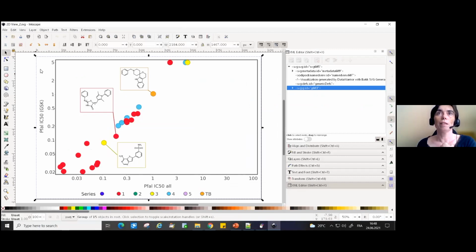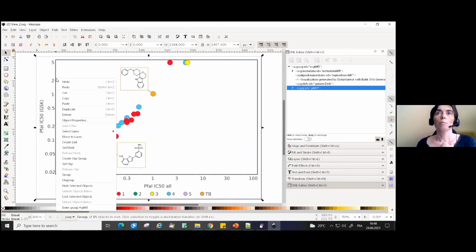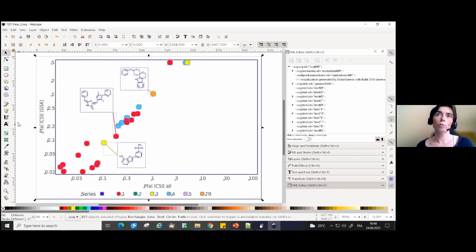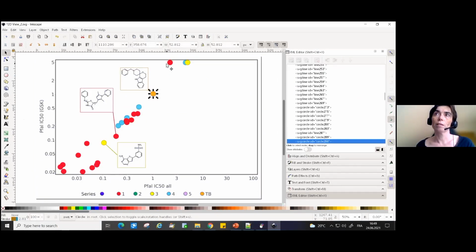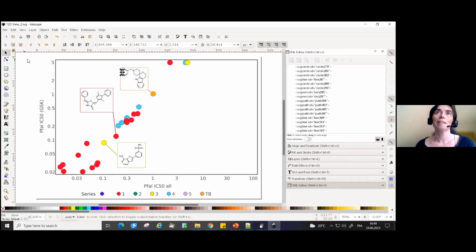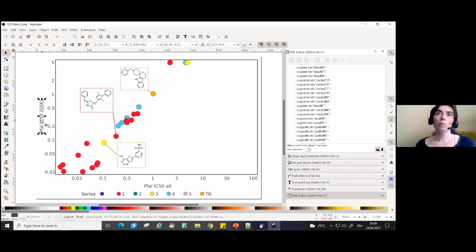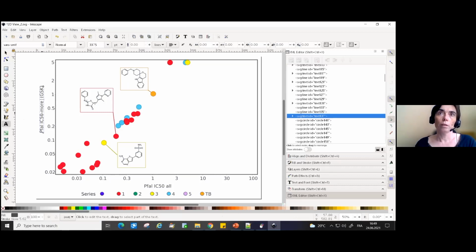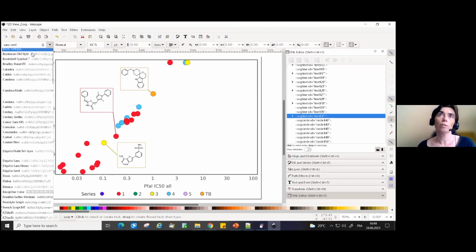So at the beginning, everything is grouped, but you can ungroup the objects. Please Ctrl-Shift-G. You can ungroup further. So now we really have one object that you can even move if you want. It's not the goal, but you could move it if you want. You can modify that if you want to put some more information. You can change the font size and everything can be changed.